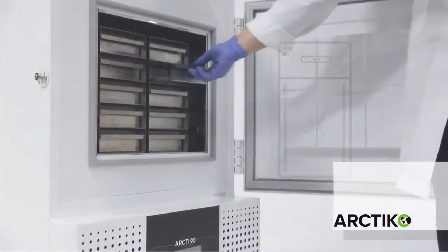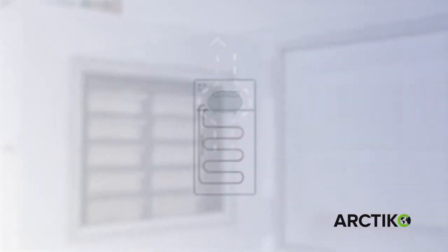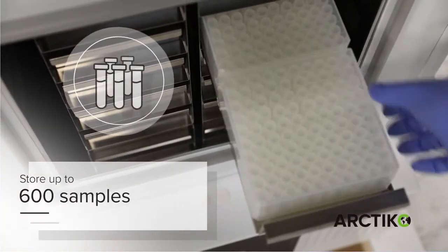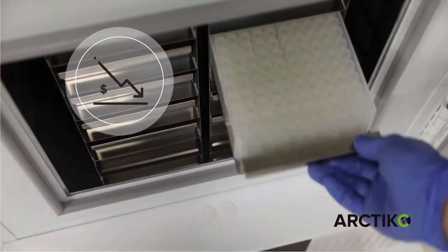The vacuum insulated panels combined with Arctico's state-of-the-art single compressor cooling technology provide a safe and high-quality ULT freezer. Our Integra undercounter models can store up to 600 samples, still maintaining a small footprint and reduced energy consumption, which saves money in operating costs.